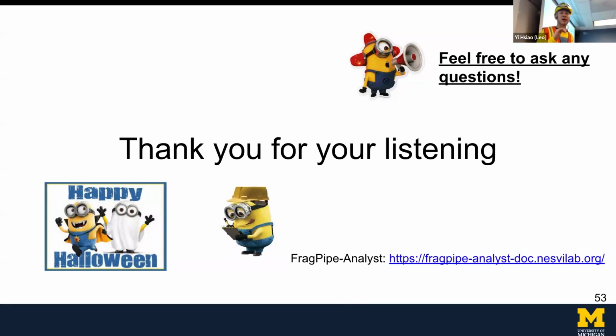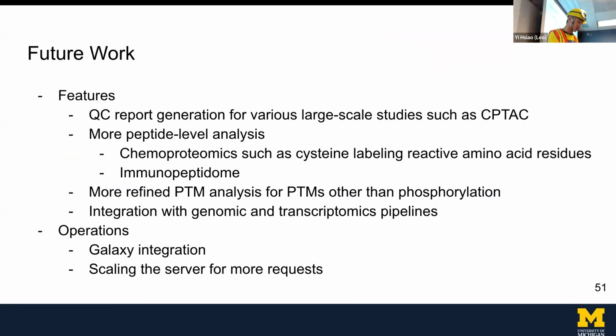And if you want to identify isoforms, then you need to put the isoforms into the database. But in this sample, we used a database that reduces a lot of isoforms. So generally speaking, we can find those things. And neoantigen is based on, like I think I mentioned here, if you want to find a neoantigen in the proteomics part, we will use an immunopeptidome experiment.